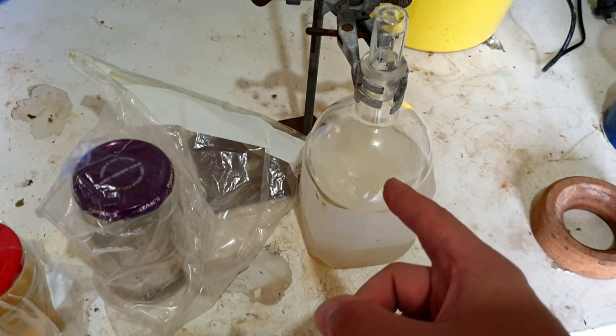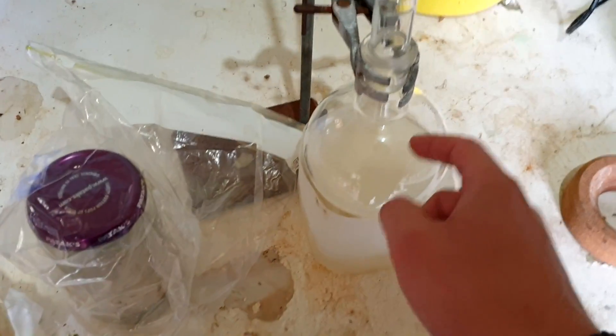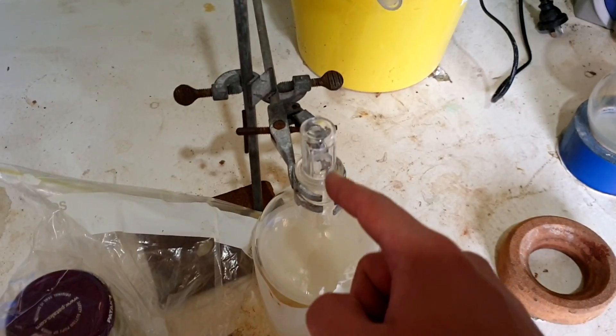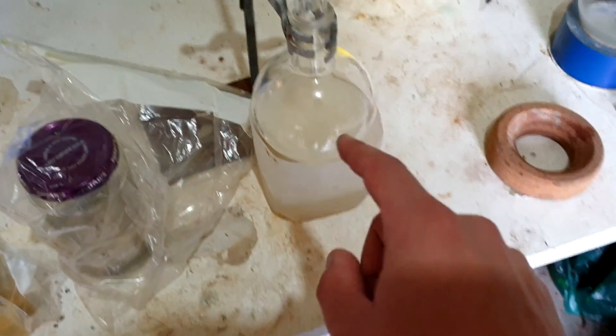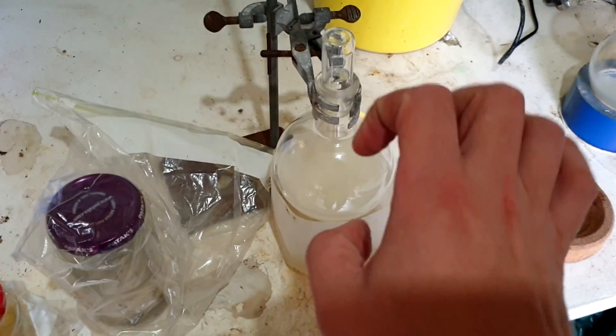I don't know how much water is in here so I don't know how violent this reaction is going to be. I'll set up the reflux condenser and get the cooling going — put in the ice bath so hopefully we can control everything.